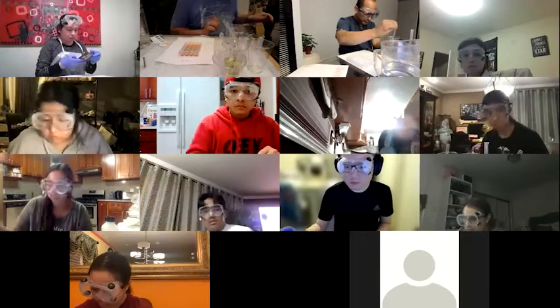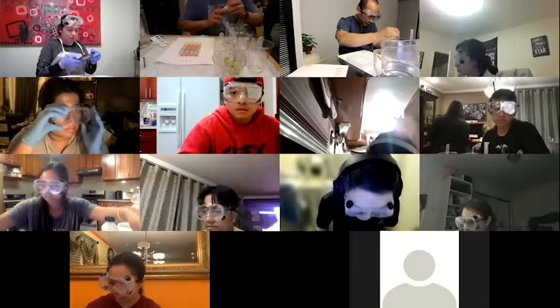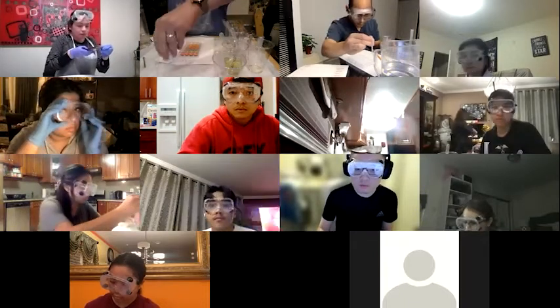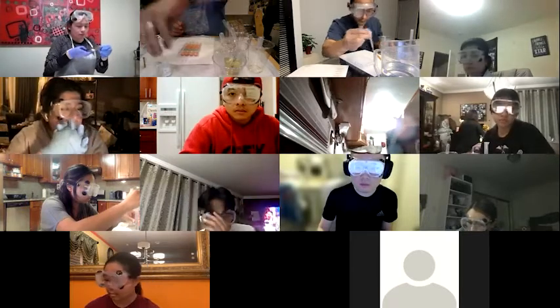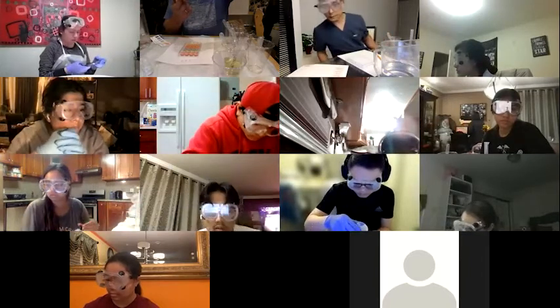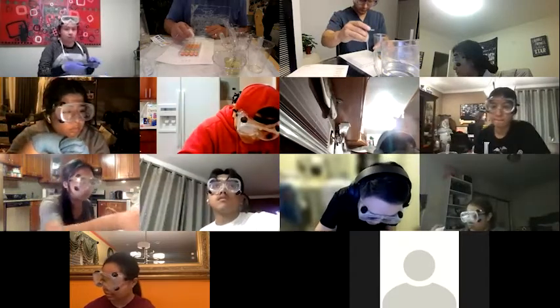So I want to make sure I have the right acid and the right base. I want 0.1 molar rather than 1 molar. So if you have the 1 molar, make sure you dilute it by a factor of 10. All right, here we go.